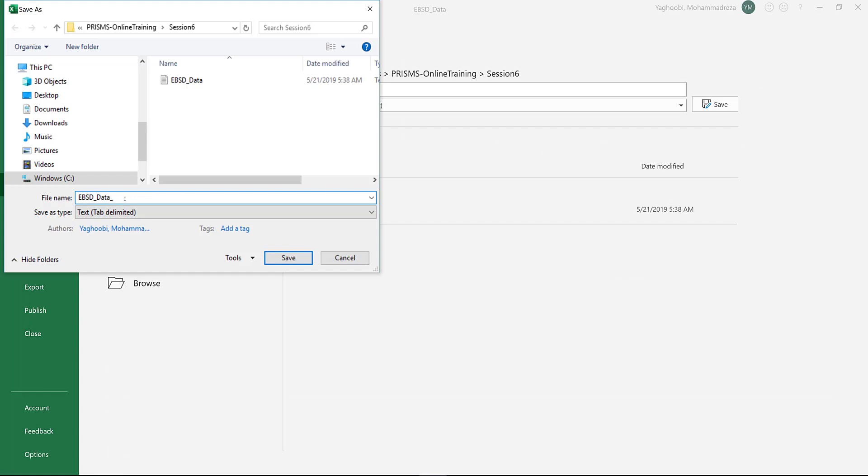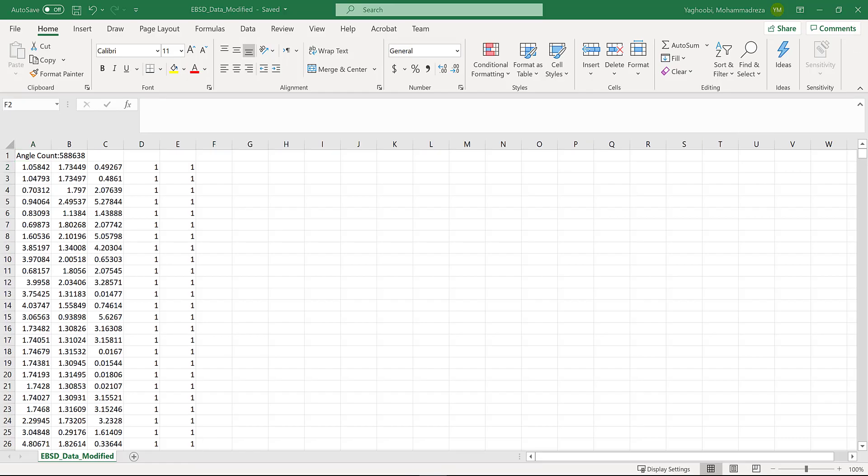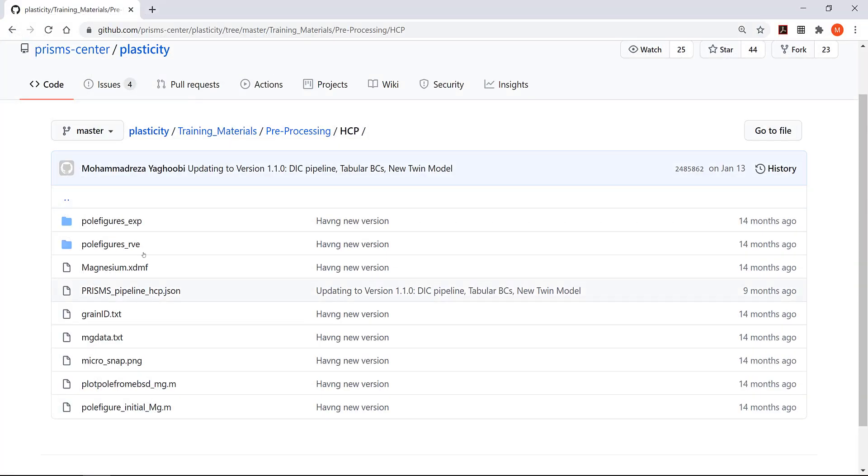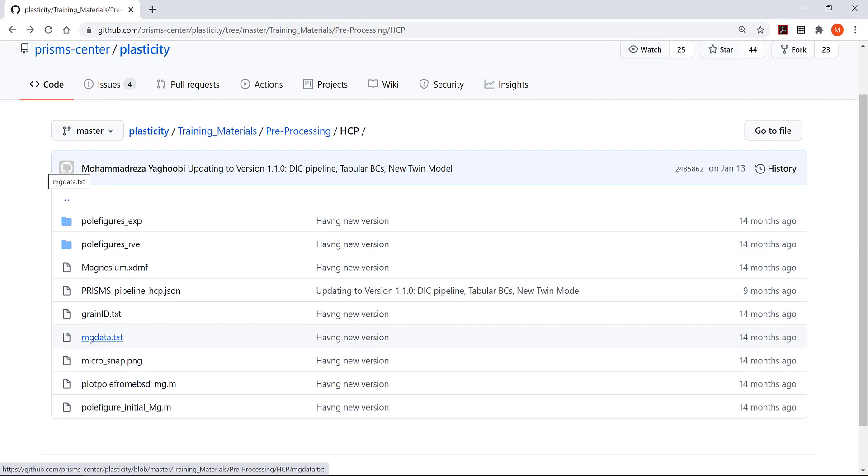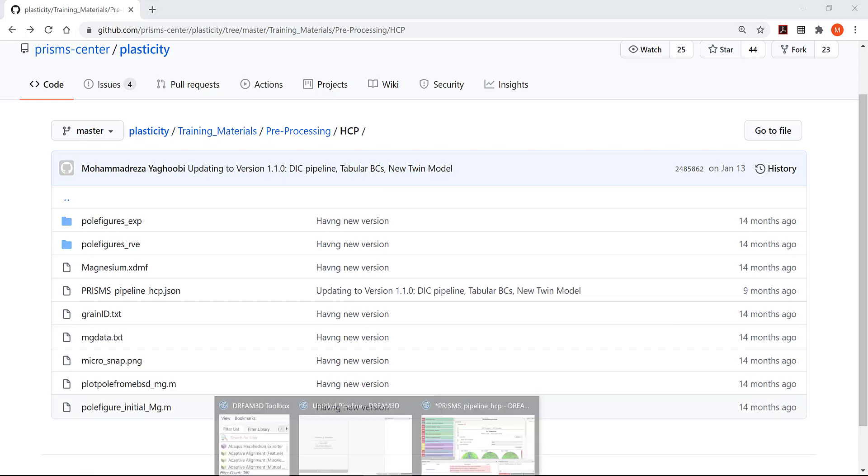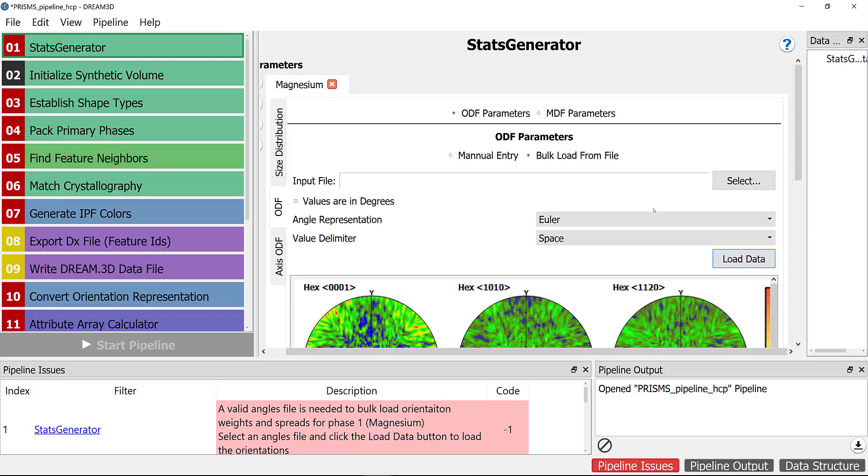Now you should save this file as 'EBSD_data_modified.txt'. If you want to make sure that you're following all the details correctly, we have a file inside the PRISMS Plasticity package in training/preprocessing/HCP which is 'mg_data.txt'. This file has a similar format as the one we just modified.